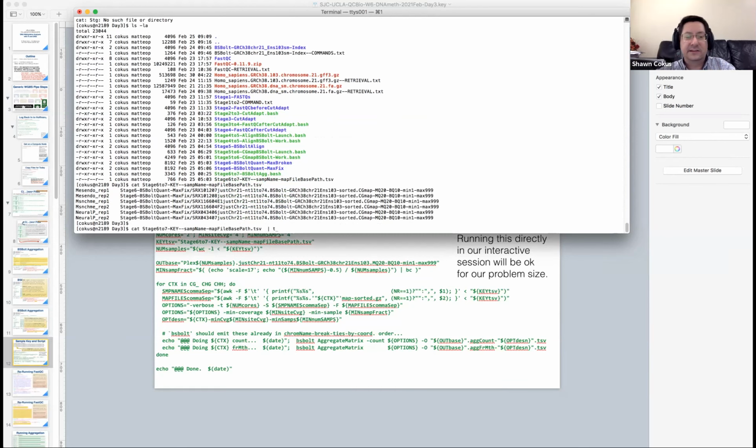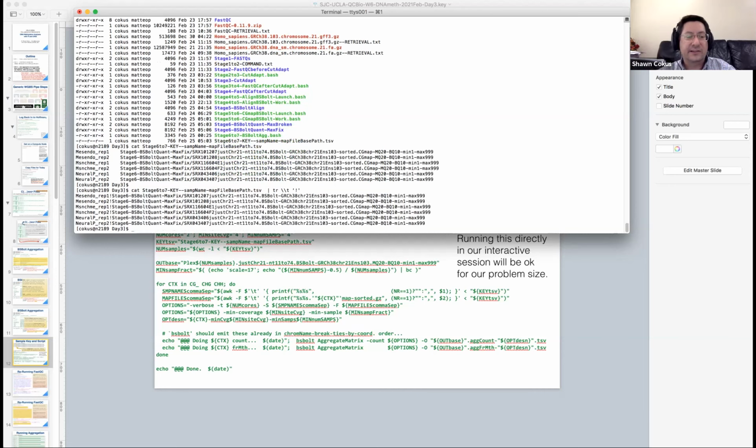The other way to check is to use tr or something and convert the tabs to something you can actually see, like an exclamation point or some character that's not used there. So now you can see that is a tab there, and there's no extra tabs at the ends or anything anyway. It's a clean 2-column tab separated file. The sample names we want to use are in the front, and I just put the tissue first, abbreviating the tissue, and an underscore, and then replicate 1, replicate 2.